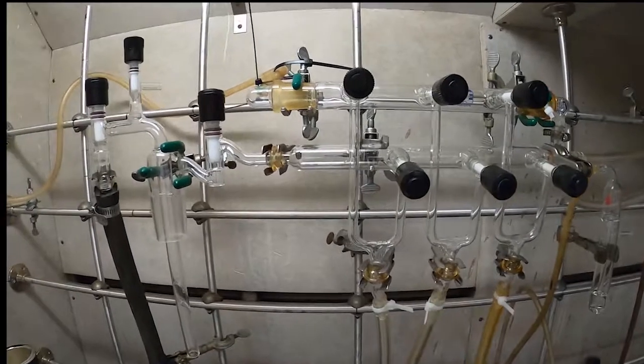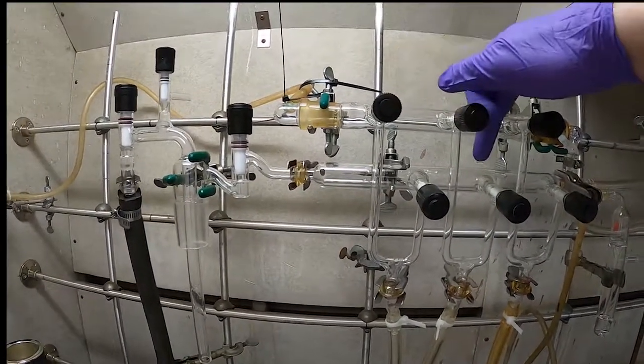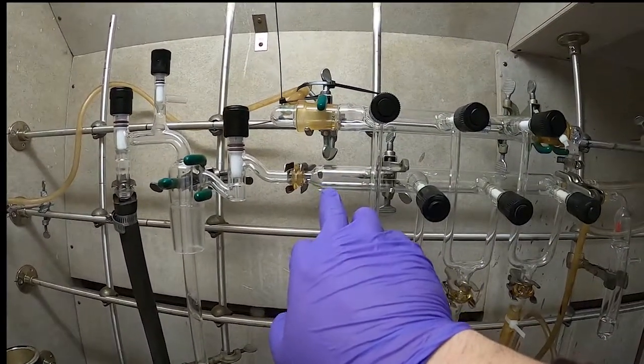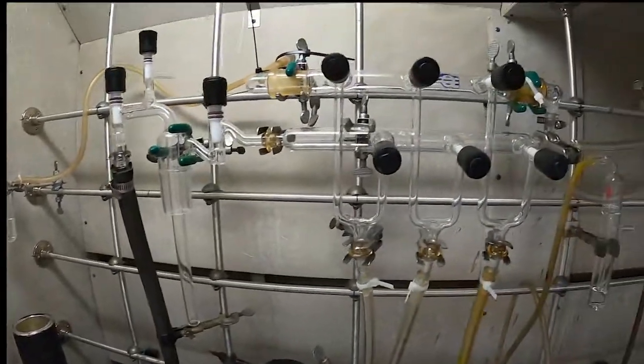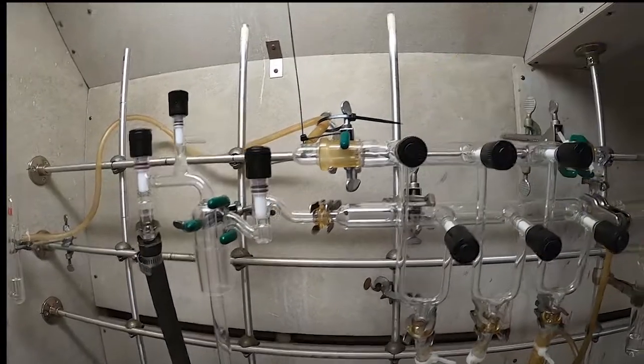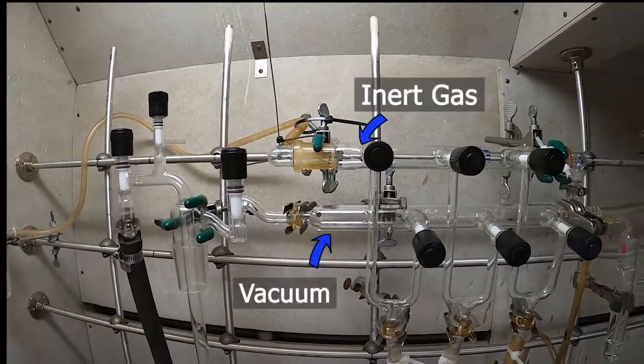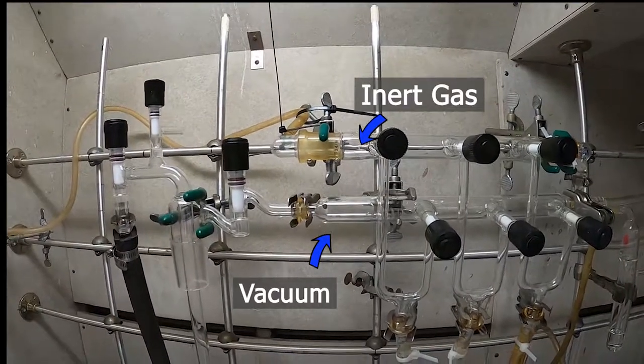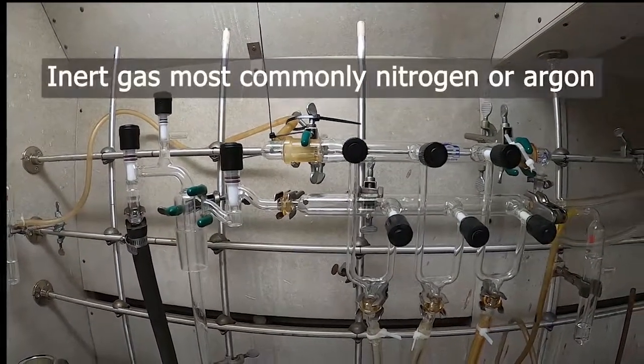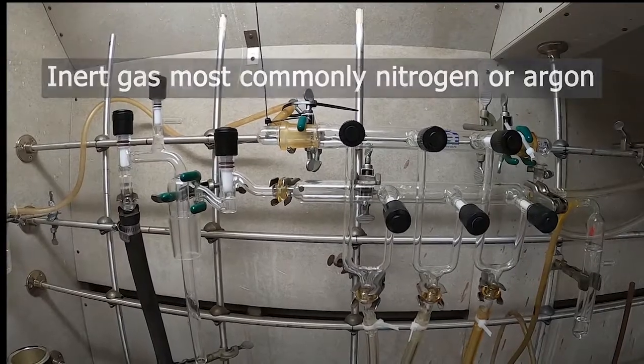So with the two parts of the manifold, we have this lower one, which is for the vacuum. As you see, it's connected to this dark hose, which goes down to the vacuum pump. And then the upper one, which is our inert gas. The inert gas can be nitrogen or argon. Those are the common ones. Other gases are also possible, but the most common are, again, nitrogen and argon.